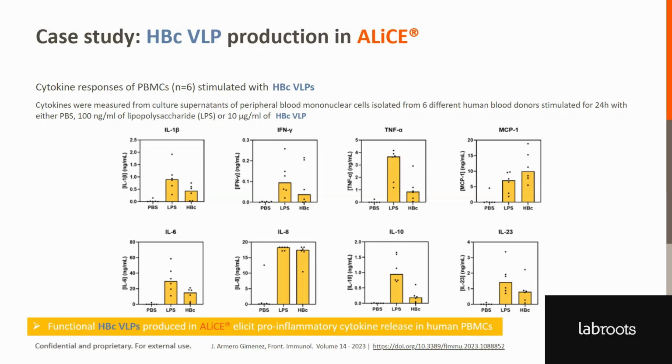It's also worth noting this low dose of this kind of a vaccine. So here's a 10 microgram per milliliter treatment. And if you consider that we're producing at around 0.5 milligram per milliliter at the liter scale, that is producing half a gram of VLP material. Based on some very, very preliminary calculations, we've considered this to be equivalent to 100,000 doses of a virus-like particle vaccine model within 48 hours in a single liter footprint.